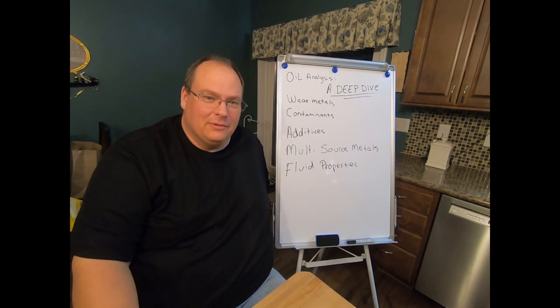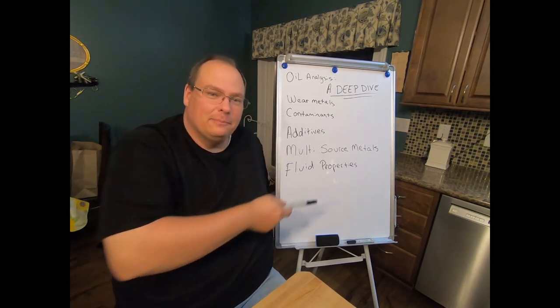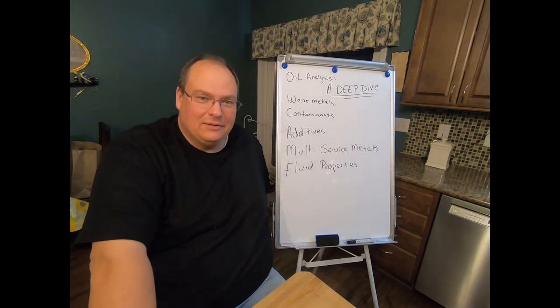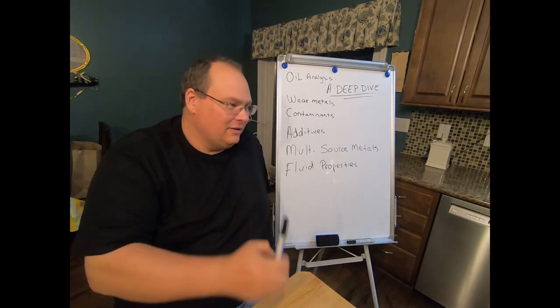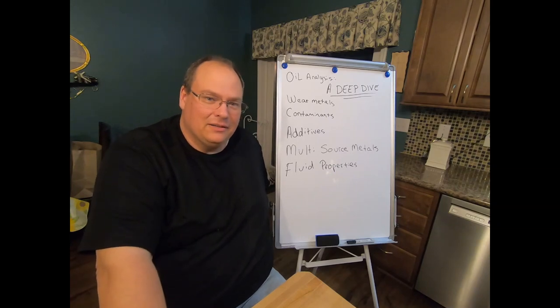Today we're going to do something a little bit different here. We're going to do a deep dive into oil analysis. It's not exactly a glamorous topic, but it is critically important if you own a truck or really any piece of heavy equipment and you want to head off any potential catastrophic failures before they occur. It's important, it's inexpensive, and with a little bit of knowledge here, you can be as good or better at interpreting this than a dealer is.